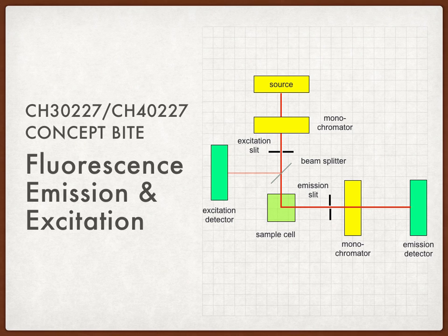But I can also use excitation spectra. An excitation spectra is where I would fix the emission detector to a point where the molecule is fluorescing, but then I would scan the excitation source, almost as if I'm running an absorption spectrometer. And what I should see in the excitation spectra is something which, more often than not, is very similar to the absorption spectra. Excitation spectra gets very useful when there are differences between the absorption and the excitation spectra. And we can use this to look at energy transfer, as I'll talk about a little bit later on.